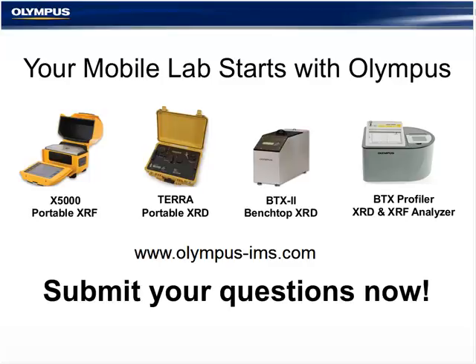Even your MWD tools are typically about 60 feet behind the bit when they're gathering information. And at most drilling rates, honestly, running a sample through XRD and XRF every 30 minutes keeps you in a similar zone as even the MWD tools do downhole.